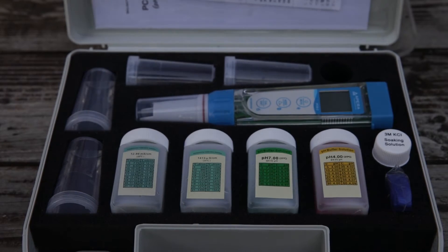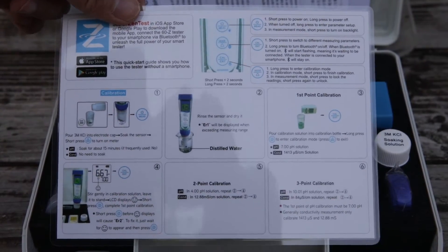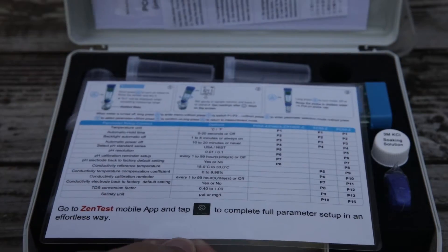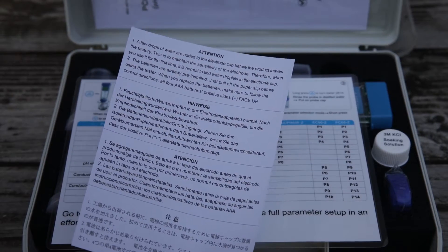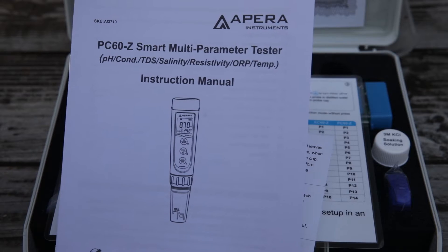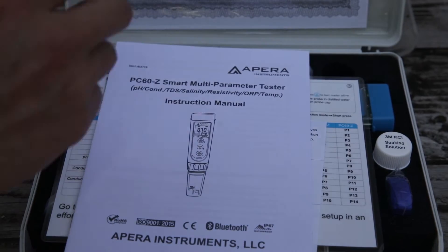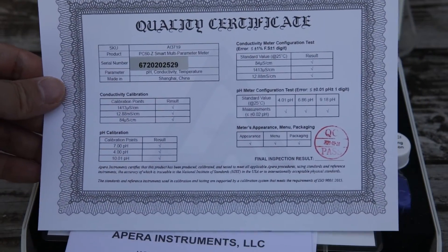It also includes a laminated instruction manual for easy reference and the PC60 manual, and last but not least, your quality certification.